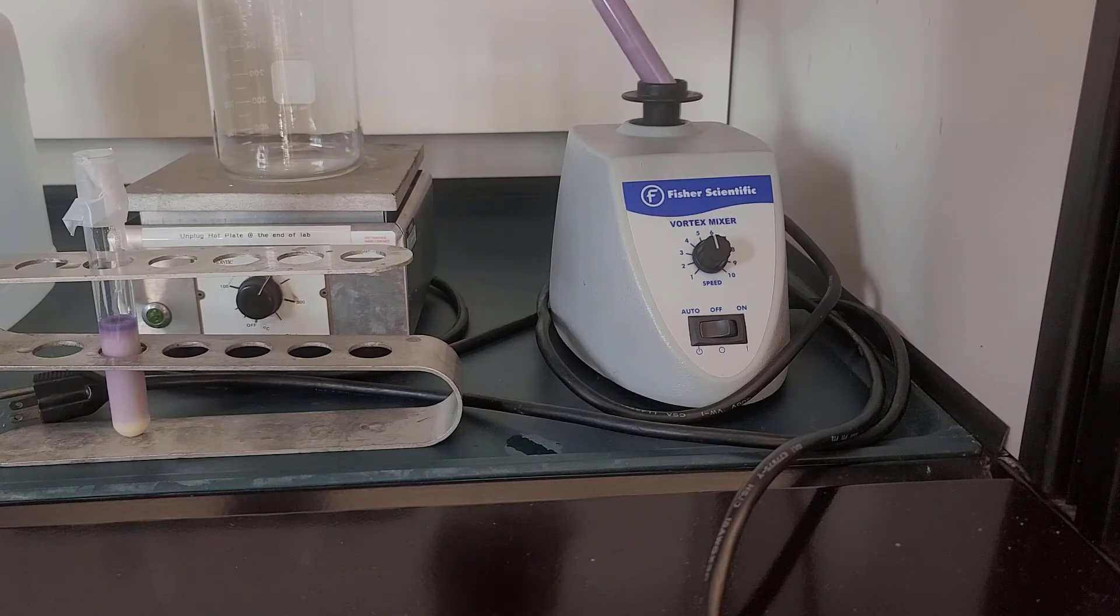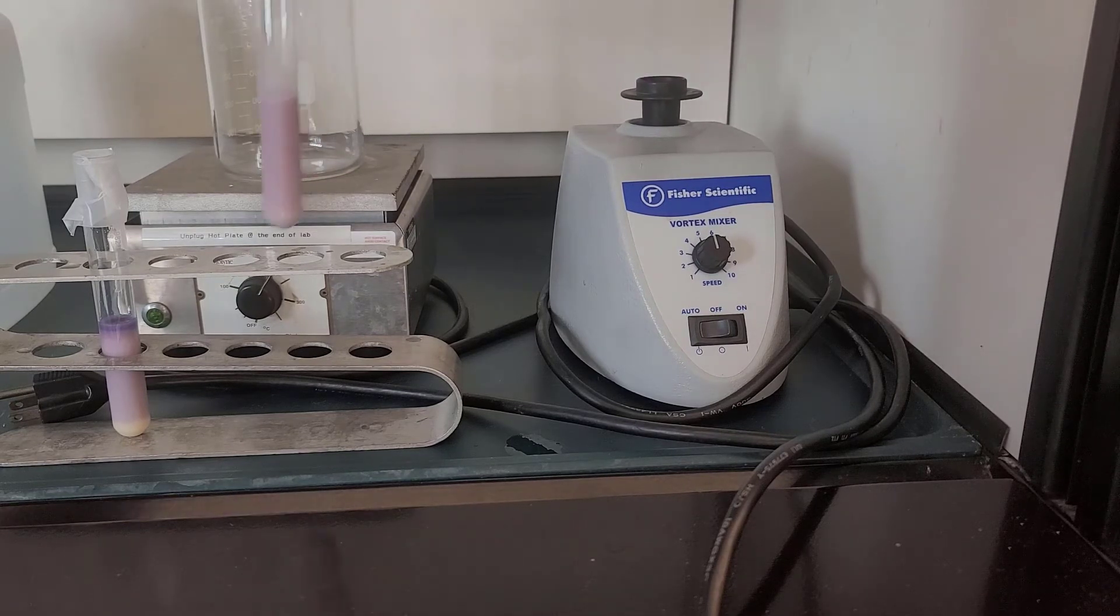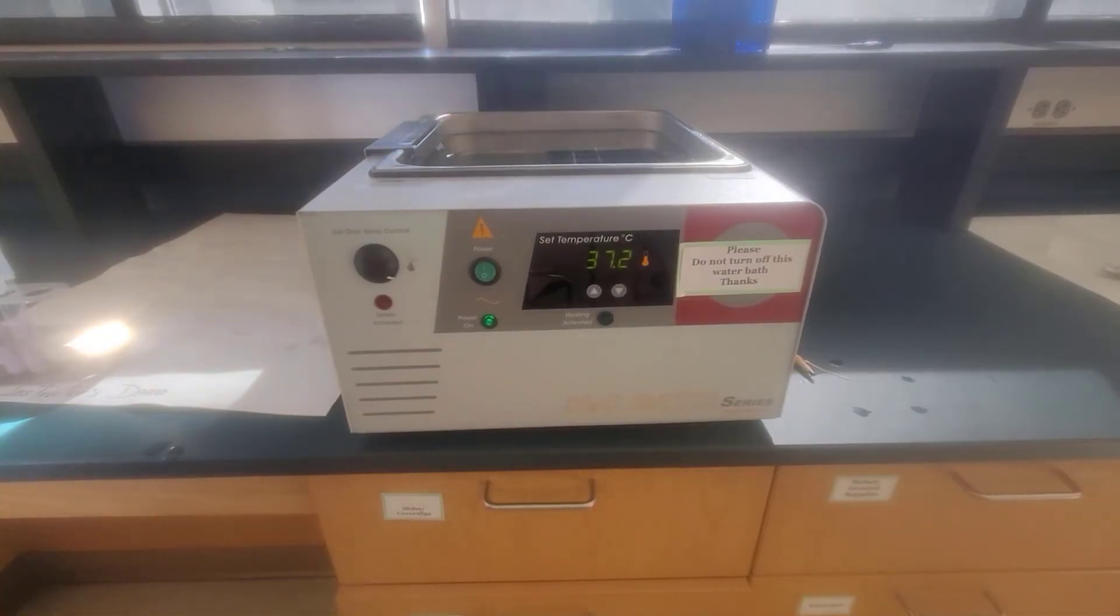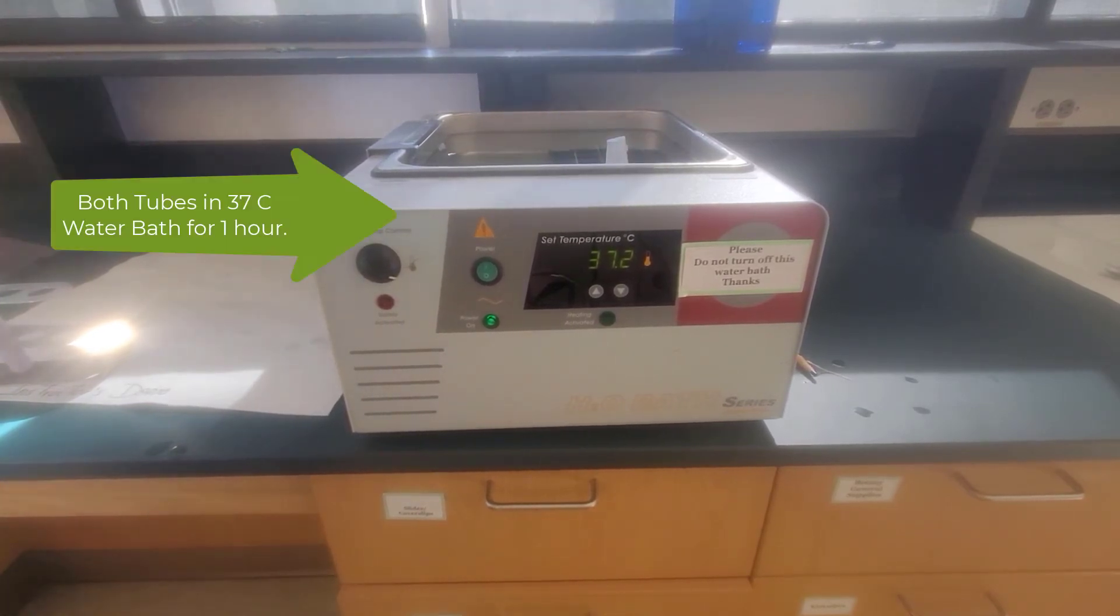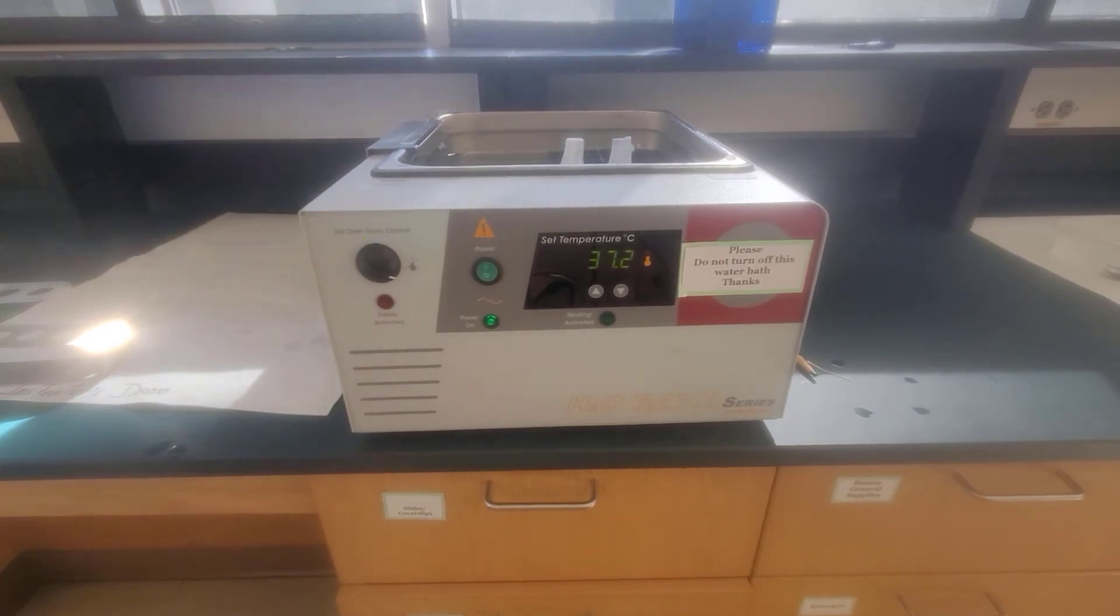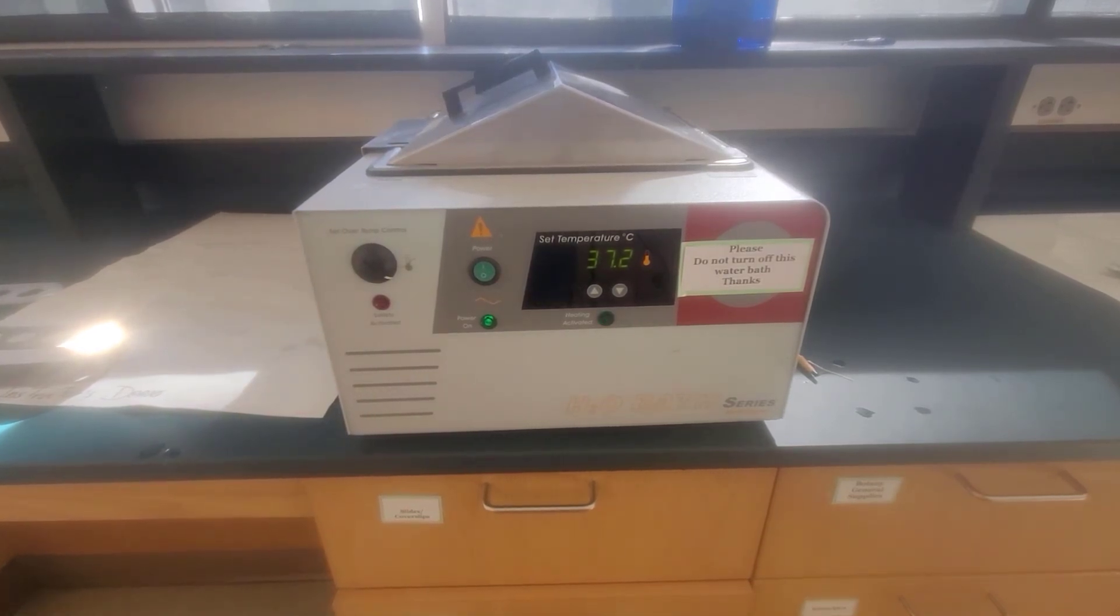And then what we need to do—this experiment takes quite a bit of time. It takes about an hour to run this experiment. So we're going to take tube one and tube two. We're going to place both of these tubes in a 37 degree Celsius water bath. So again, 37 degrees Celsius using the metric system—37 degrees Celsius is about the same as body temperature. So we're going to place both of these tubes in our 37 degree water bath, and they need to sit in there for about one hour.